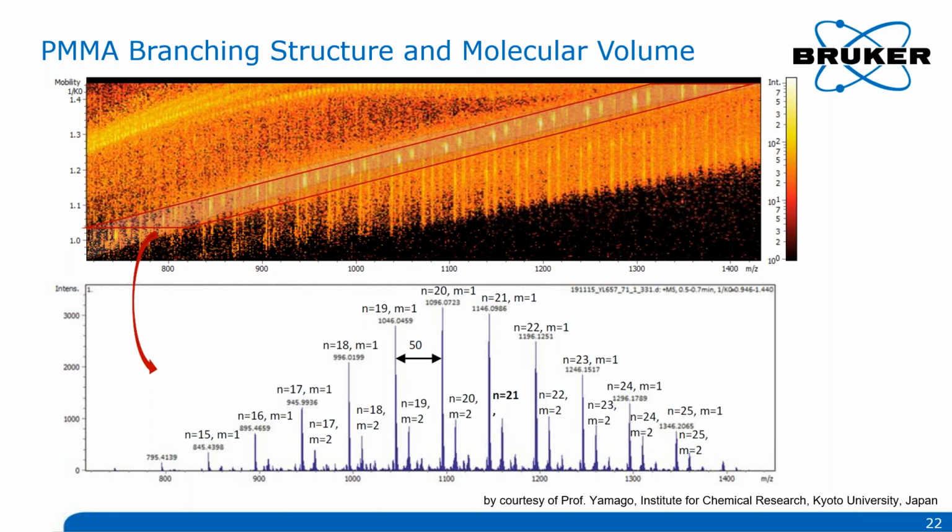For instance, we can select a region of the heat map and extract a mass spectrum, just like we did before. This will allow us to calculate the average molecular weight and its distribution for the given polymer series. And obviously, we can also do the usual end-group analysis. Specialized software packages can do that automatically.